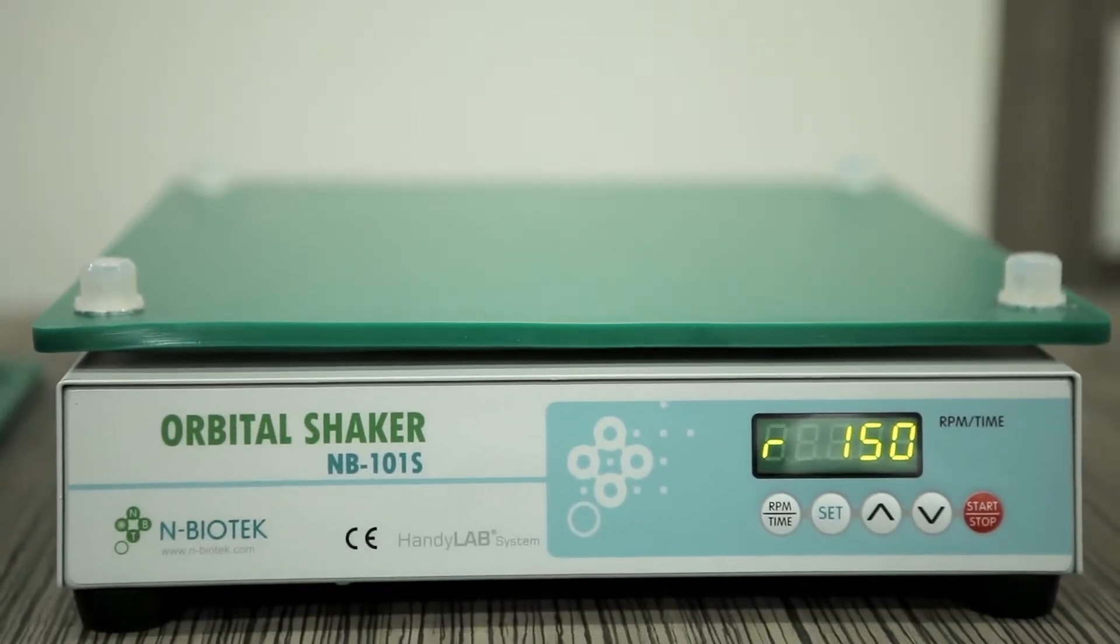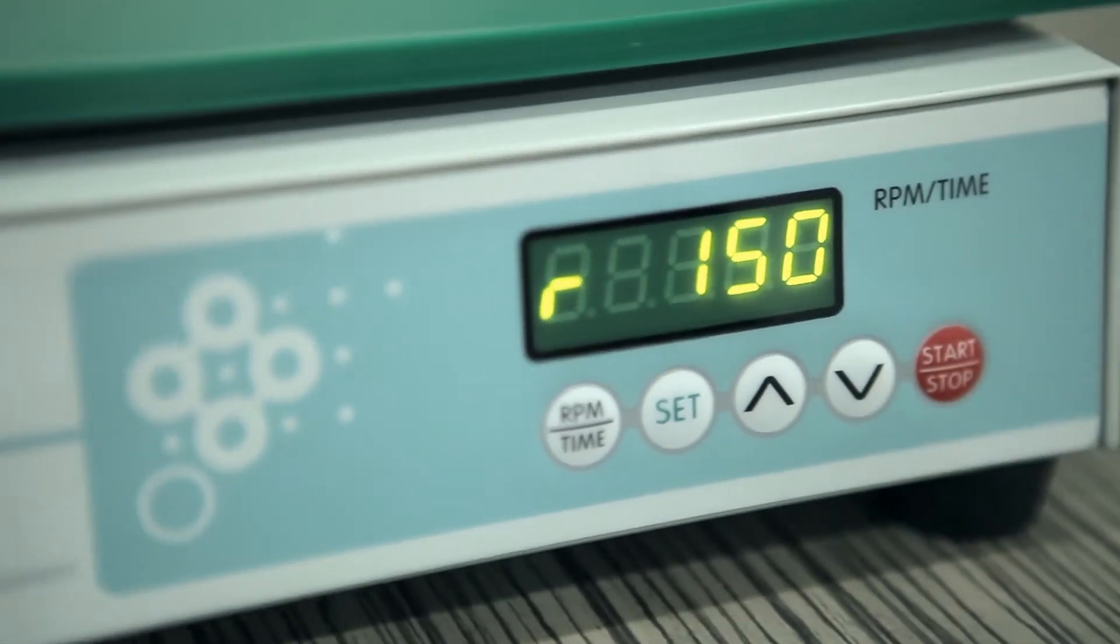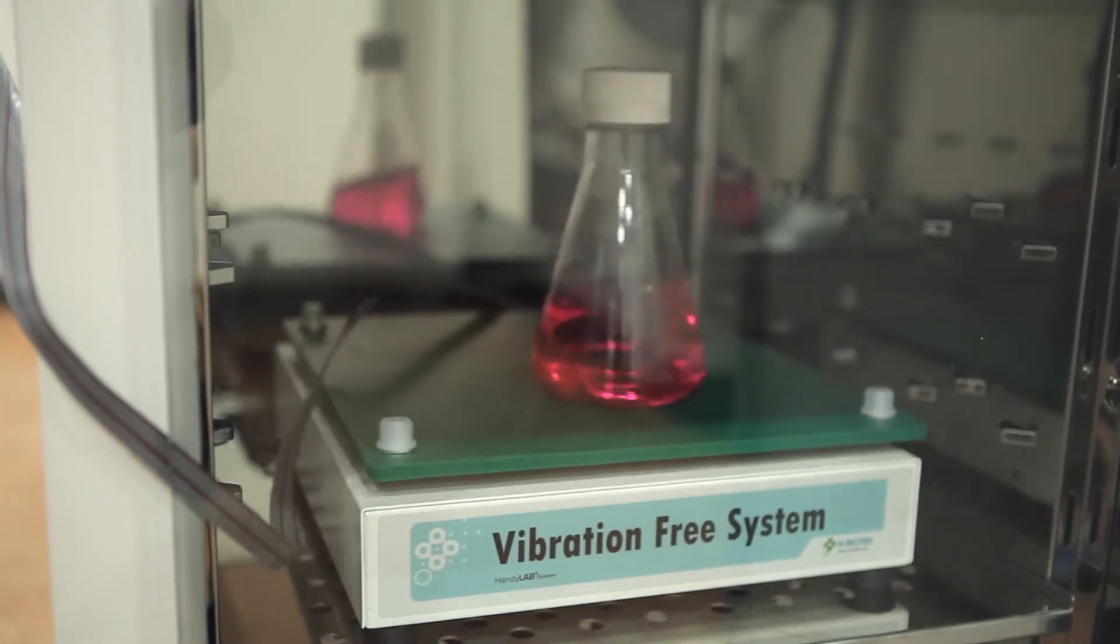NBiotech's Remote Shaker is an optimized product used inside the incubator. It separates the shaker and control box and connects it with a flat cable.